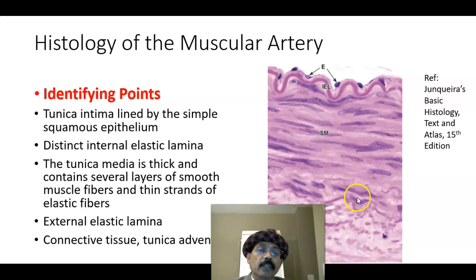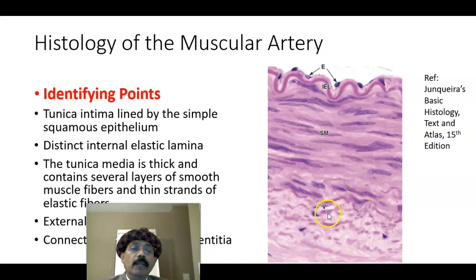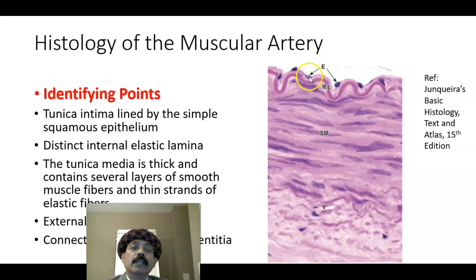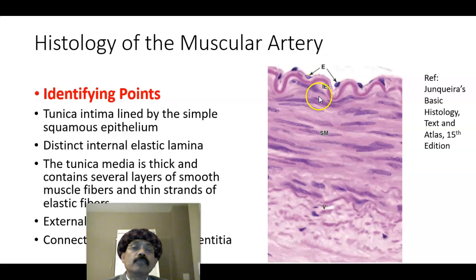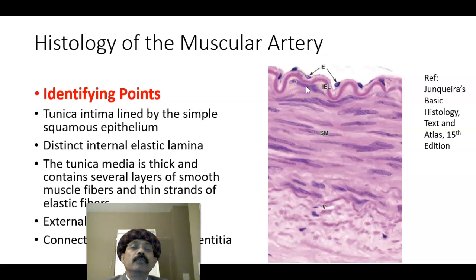We also have an external elastic lamina, which is indistinct in this slide, and the tunica adventitia, which contains the vasa vasorum, lymphatics, and unmyelinated nerves. The endothelial cells are simple squamous epithelial cells connected by tight junctions or occluding junctions. The endothelial cells have processes that go through the fenestrations of the internal elastic lamina and communicate with the smooth muscle by means of gap junctions.